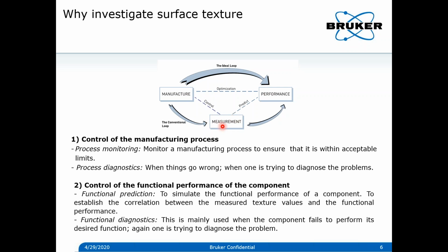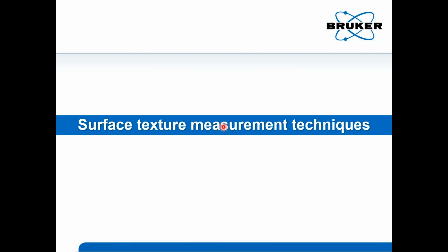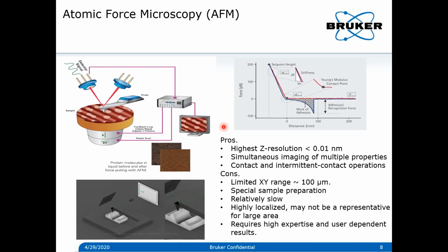So starting with any surface, you keep doing the measurement to understand what the surface properties are. Now I will move on to the surface texture measurement techniques. This will be an overview of what can be used for measuring the surface texture.